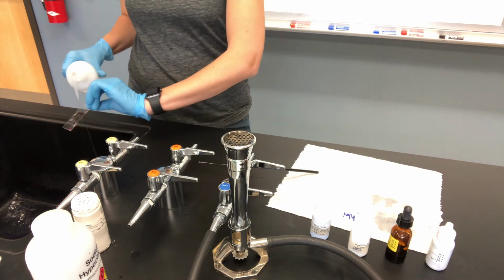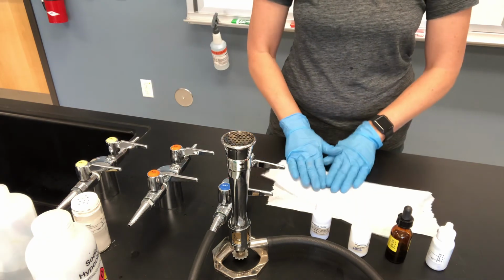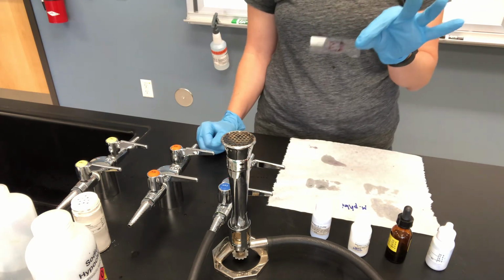So then we rinse our safranin, and this is where we can blot dry. And then it's ready to go under the microscope. So that is how you do your gram stain.